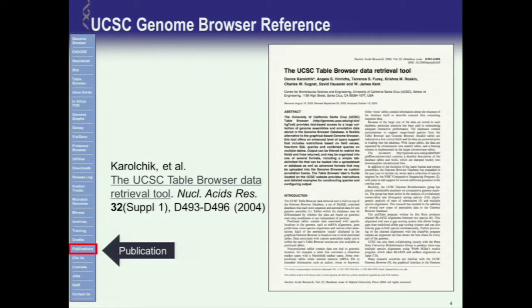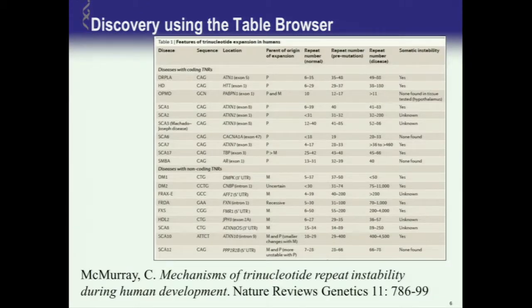There's a paper here if anyone wants to look at that, just describes the table browser tool. So let's start digging into this. And what we're going to do here is go through a couple of specific exercises that will illustrate the functionality of the table browser and also show you how you can start to get answers to some biological questions in pretty rapid time.